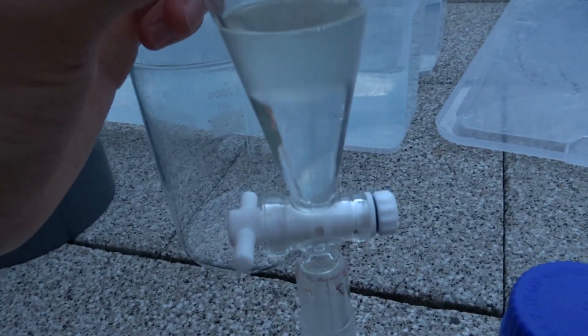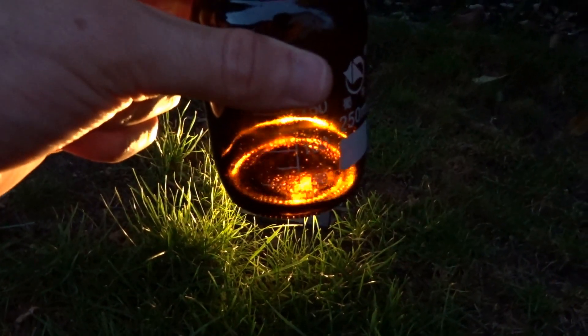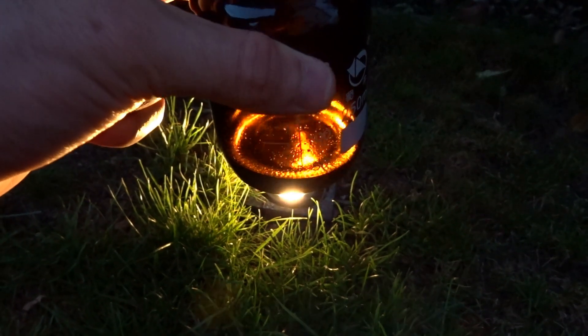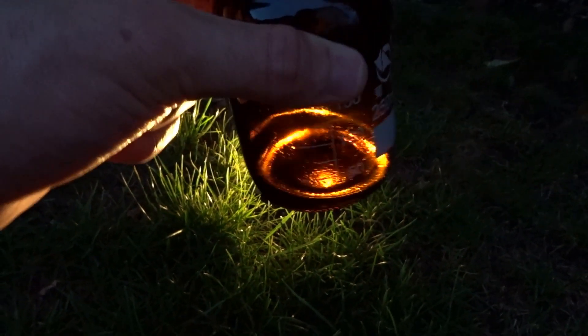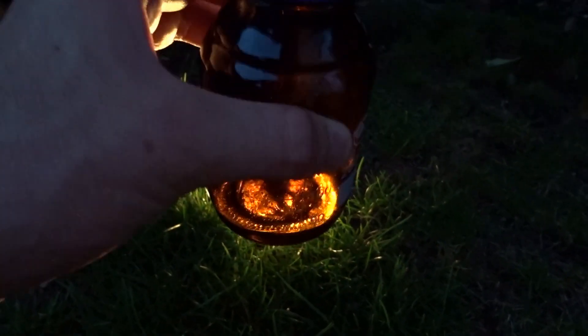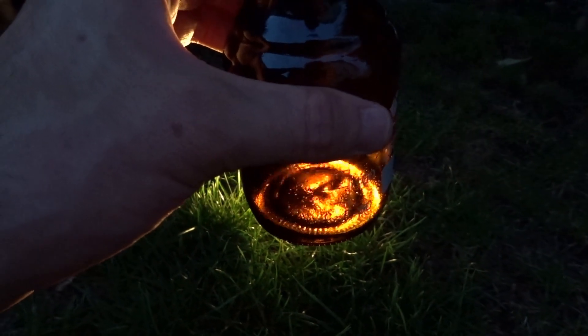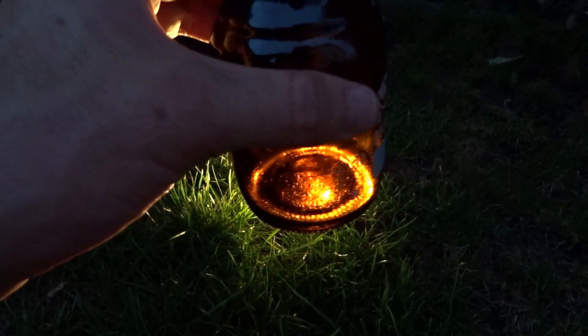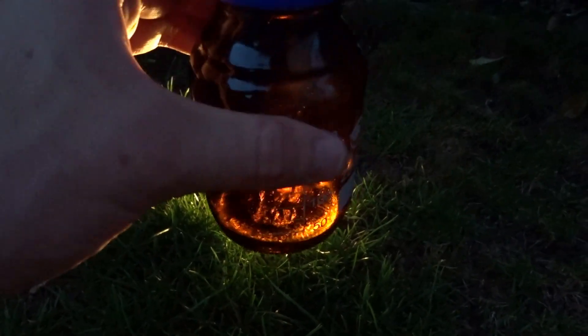So there we have it. The chloroform. Probably a little bit difficult to see, but that's what you get. Around 45 milliliters of chloroform from 2 liters of 12% bleach. That's actually quite okay.